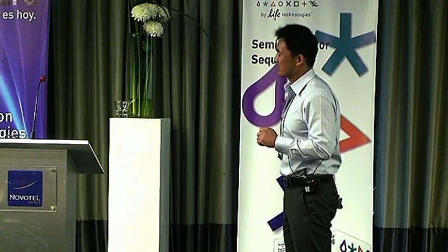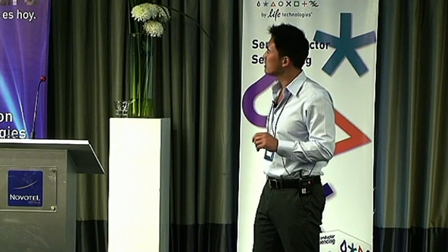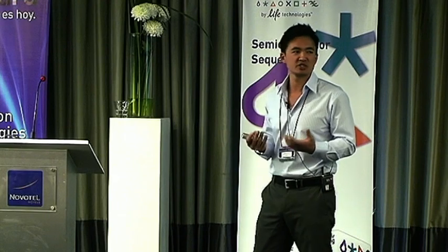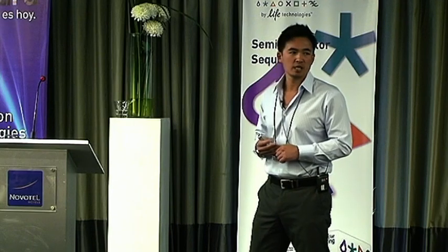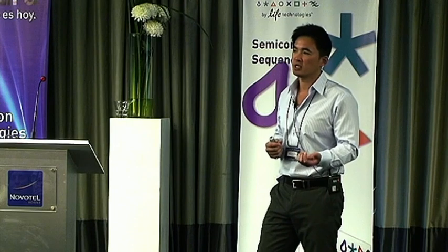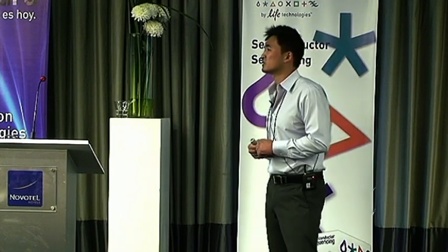This is work that a group did at basically North Shore Cancer Center in Hempstead, New York. It's a recent poster where they're looking at ovarian cancer. What they were trying to do here is show in ovarian cancer if they could come up with a predictive gene signature for survival after surgery and chemotherapy. And what they found is a 90% correlation. Using this technology, they were looking at microRNA profiles in plasma. So if they could just look at the circulating microRNA levels in blood, could they come up with a predictive signature, a gene expression or microRNA signature, predicting survival rate?